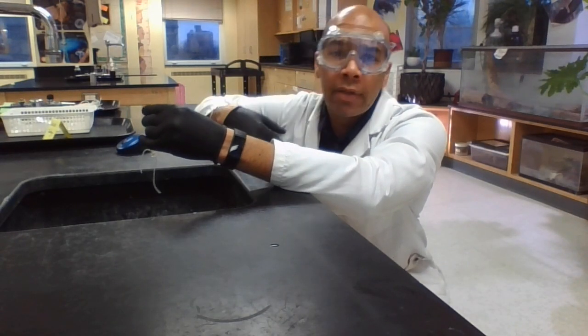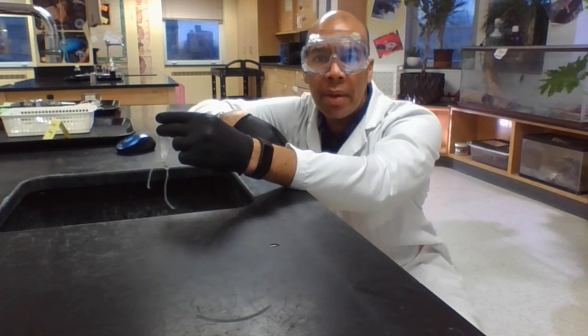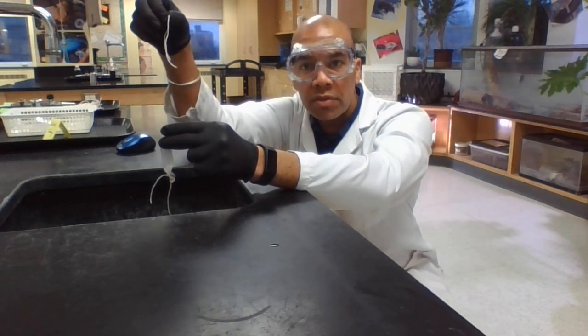Hello again. This is me at the sink. All right, so you're at the sink. The reason why you're at the sink is because you're about to tie the other side. So make sure you're at a sink and you have one partner has the other string.